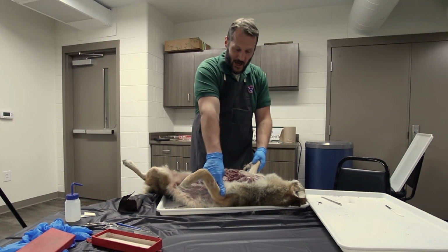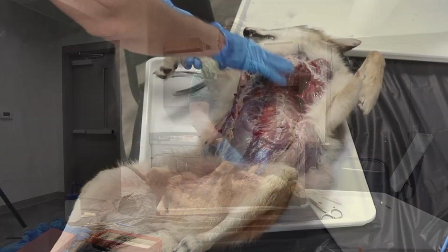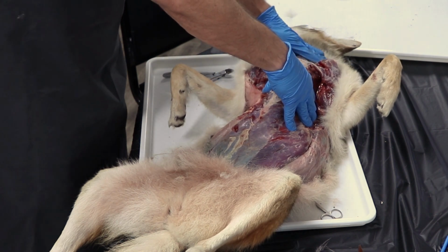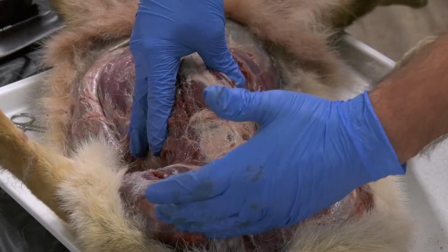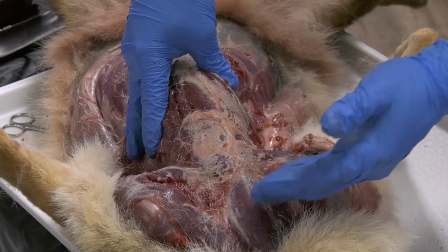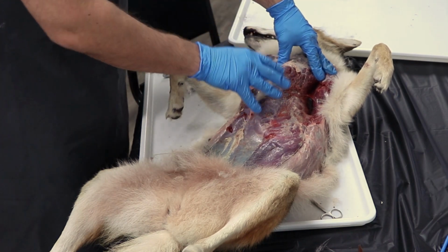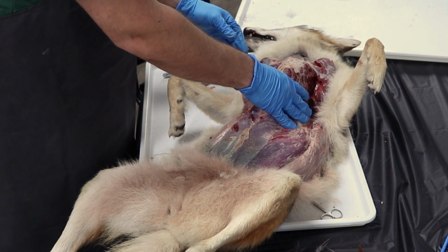Okay, so that's about as good as we're gonna get it for now. Right off the bat, there are some things that we can see. We can see some musculature, and this is a lot of the same muscles that we have. A lot of the muscles of the chest, they have a triceps brachii and a biceps. They've got some of the neck muscles, the pectoralis muscles. There's a deltoid back here. Virtually all of the same bones that we have are found inside the coyote here.